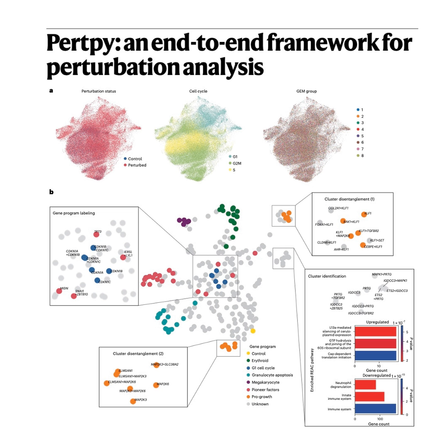And they went even deeper, looking at how cells talk to each other. They did, using Pertpy's implementation of a tool called Dialogue. They found these multicellular programs, or MCPs, which are like functional units of interacting cells in the tissue. One of them, MCP2, seemed to be associated with a good response to treatment. And what defined that program? It was linked to an interaction between the cytokine IL-7 and its receptor on T cells, which is important for T cell survival. And crucially, they saw an increase in genes like JUN, FOS, and FOSB. These are key parts of the AP1 complex, which is known to affect T cell activation and, potentially, their anti-tumor activity.